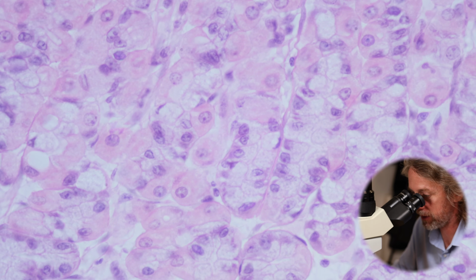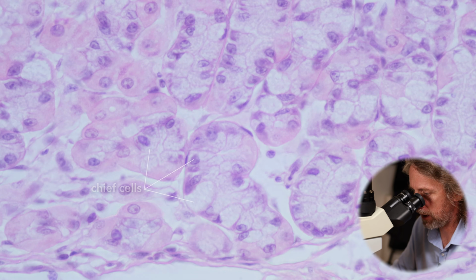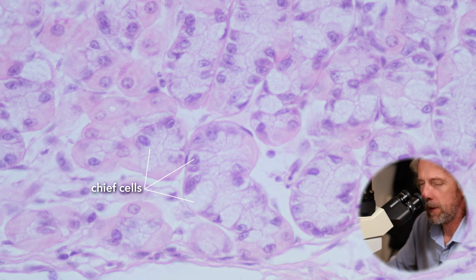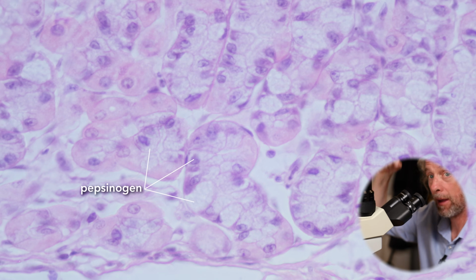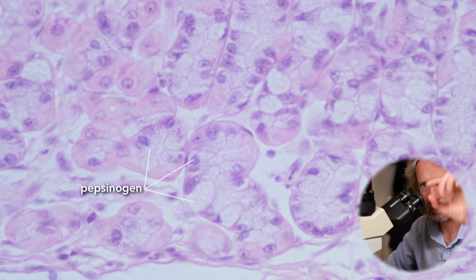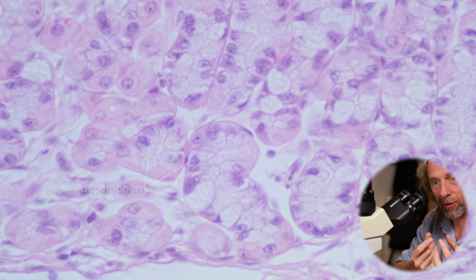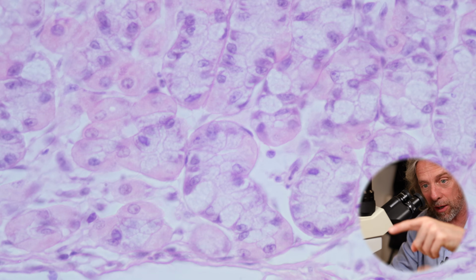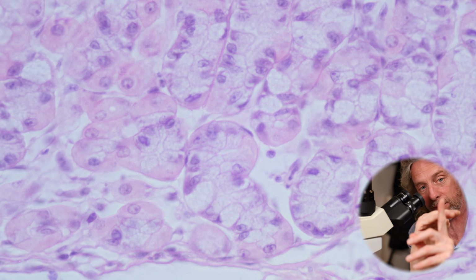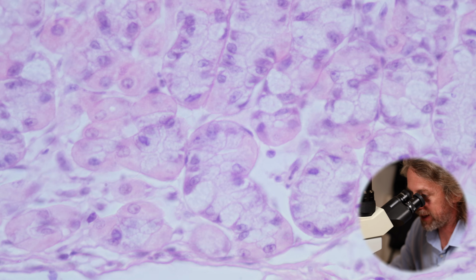And then we're seeing some other cells kind of like the segments of an orange with a hole in the middle, maybe, if we get the section right, or like a long space in the middle, because there's a bunch of cells around a duct, and they secrete into that duct. So if the duct is a long tube, depending upon whether we've cut the duct like this or like this, it might look in different ways. So that's the other cell type.